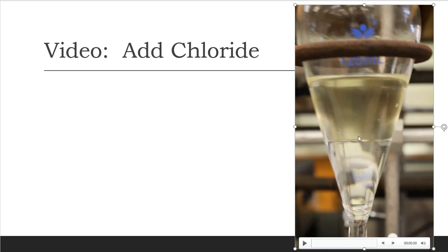All right, so once again, you can make your observations the way that you want to, but that was the second portion of sodium chloride. So a previous addition, rocking, shaking, draining had happened at this point, and this was the second addition because the lab directions tell me, do it twice. So I did it twice. Now I'm getting ready to rock and drain one more time.